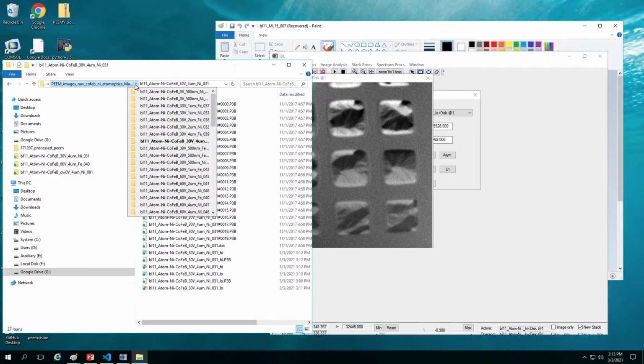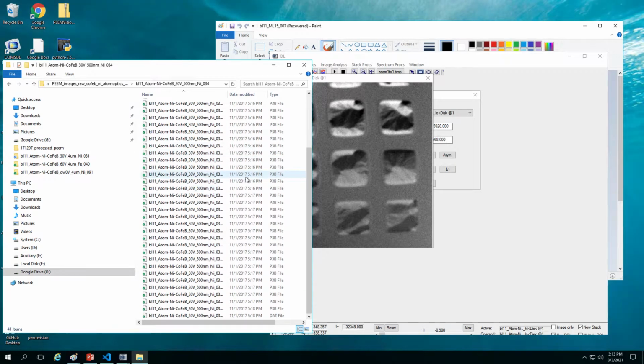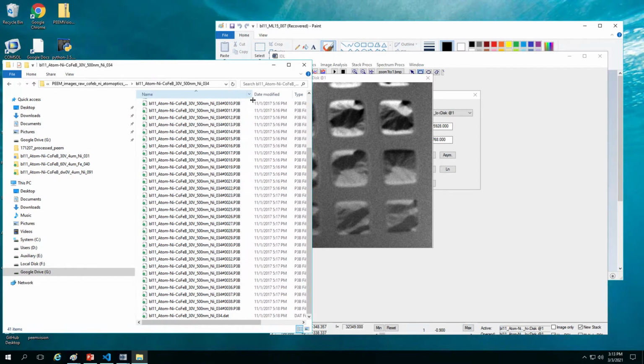Okay, so once this is done, you could also go to another file. See here, this kind of sample we took, I think we took 40. Yeah, we took 40 of them, from 0 to 39. That was because those features are fairly small and we are zooming in a lot. And to get high resolution images, we tend to take more repeats of the images. So now I think you're in a block of 20, block elements 2 and then block size is 20.